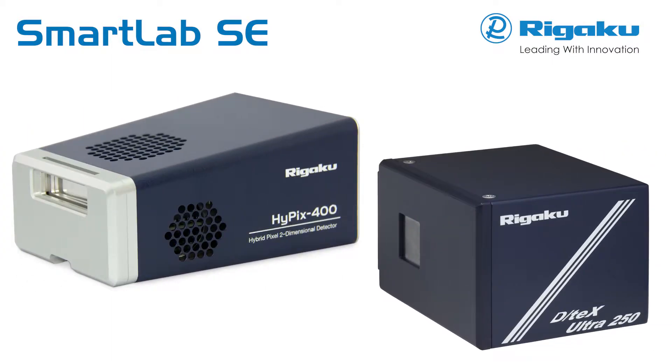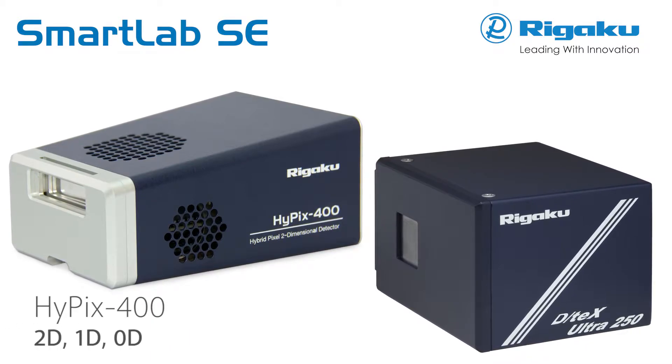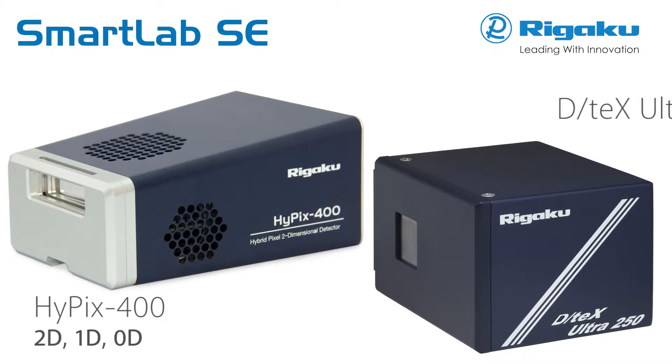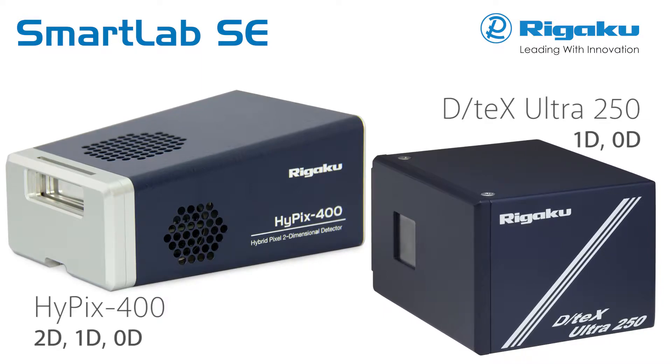Two sophisticated detector choices are available. Hypix 400 is a 2D hybrid pixel array detector that can operate in 2D, 1D, or 0D modes. DTEX Ultra is a silicon strip detector for 1D and 0D operation.